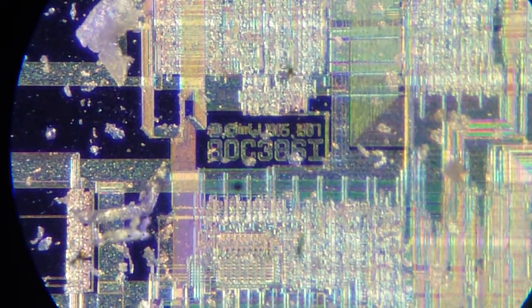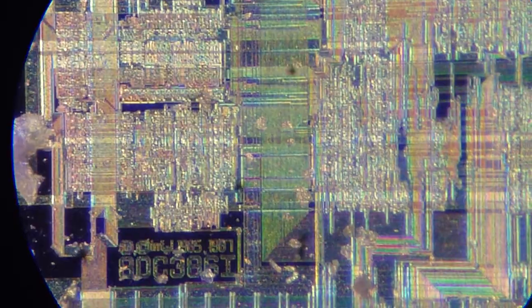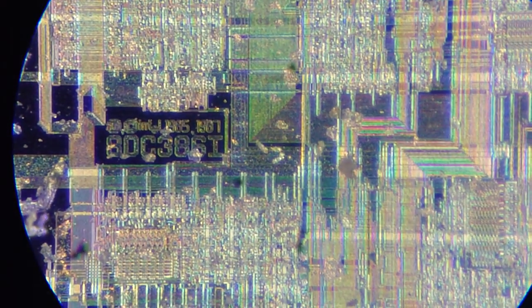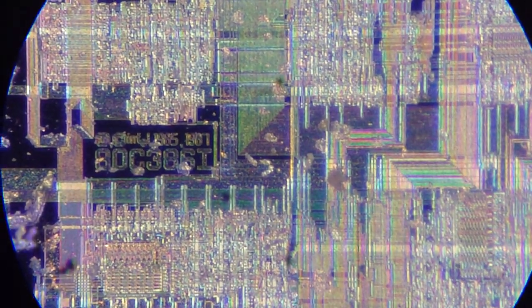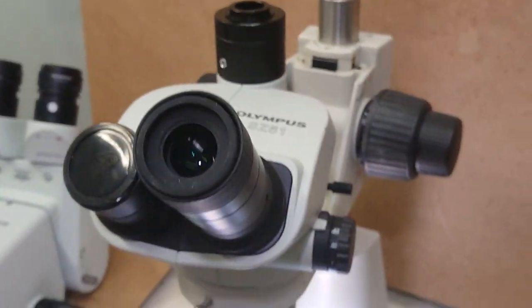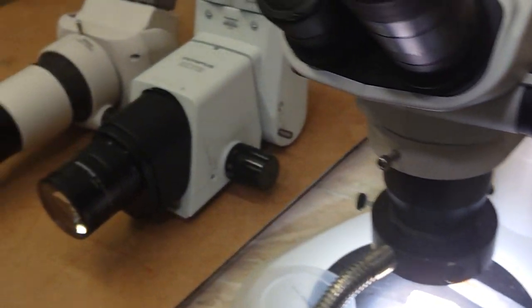If you look at the center square, you might notice something like a striped structure. But to be frank, the structure is not seen at all clearly, just kind of a tint of a structure. Okay, so we've checked our Olympus SZ61. Now let's switch to our next one.